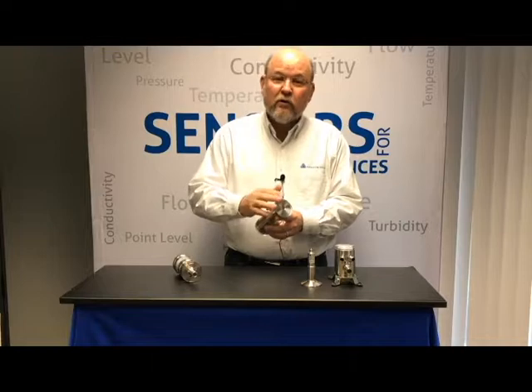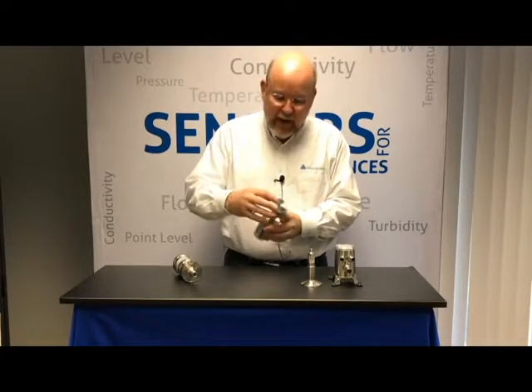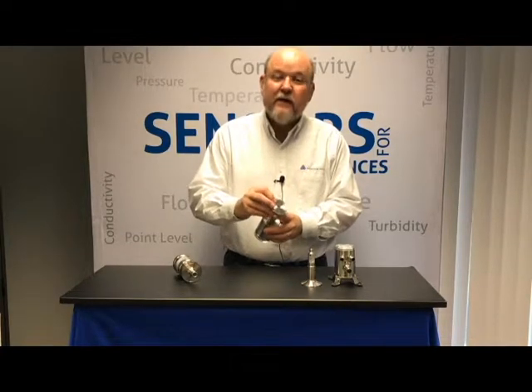And behind that sapphire lens, we have a lamp that emits light into the product stream. What we're looking for is the particles that are suspended in the media to reflect back some of that light. Now, the more particles present, the more light is going to come back to the sensor. And to look at that light, we have a second aperture, and behind that a light sensor, so that for the light that comes back, we measure the intensity and then calculate from that a measurement of turbidity.